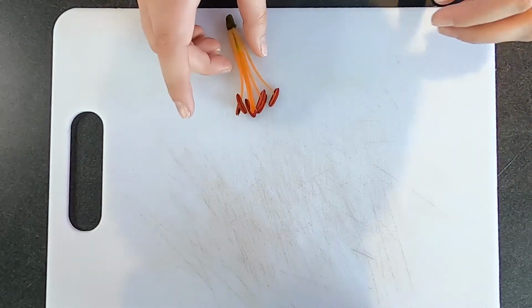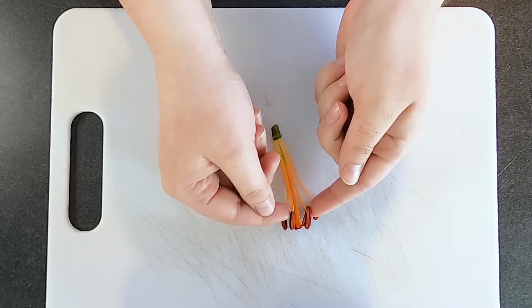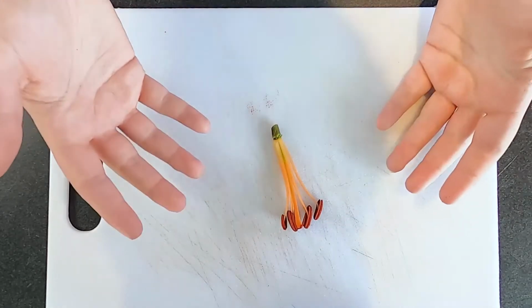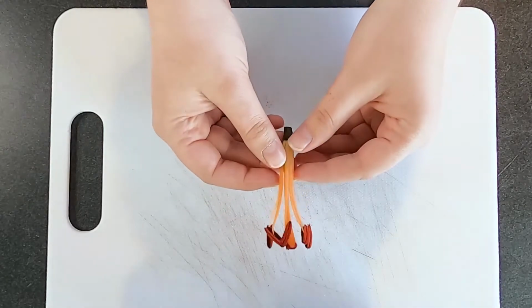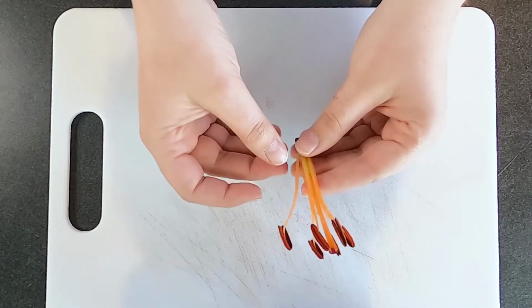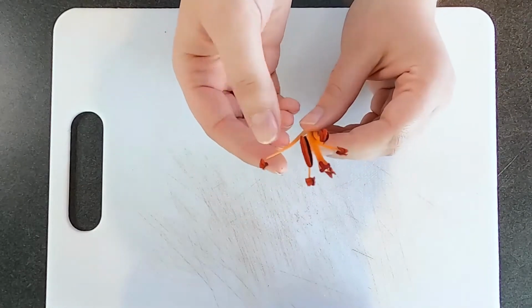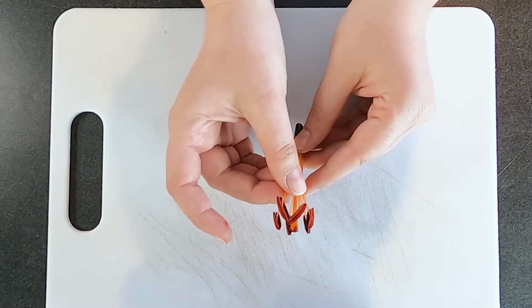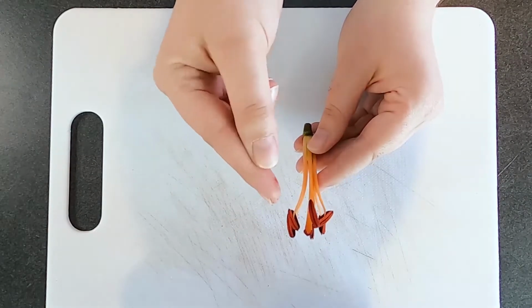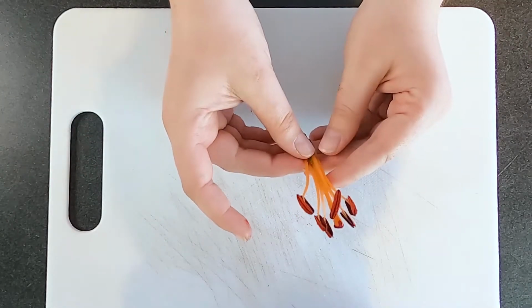And next, what we're going to look at, we have the inside here. So you notice these big kind of funny hat looking things. These are our anthers. So we're kind of moving into these male parts. So the male parts of this flower are very important. That is where the pollen is created. So I'm just going to point out here, I don't know if you can see very well, but we have actually some pollen, and you can see on my finger it's actually falling off. So this is very good. This is a good time when flowers are going to be spreading their pollen.